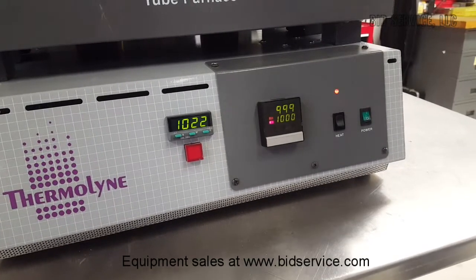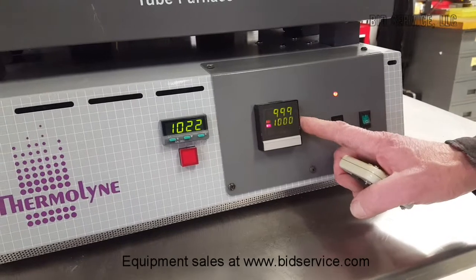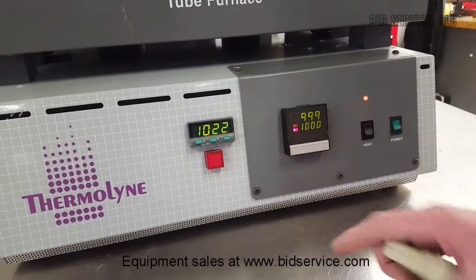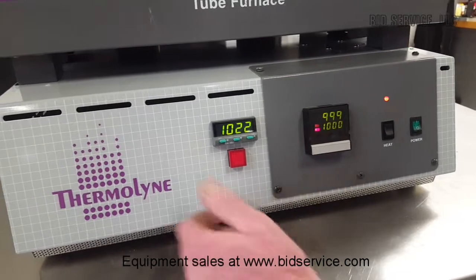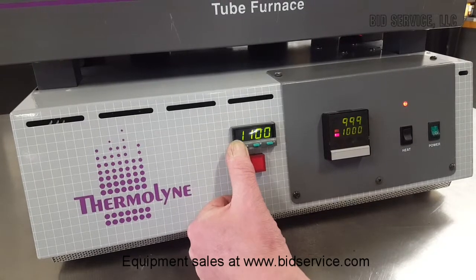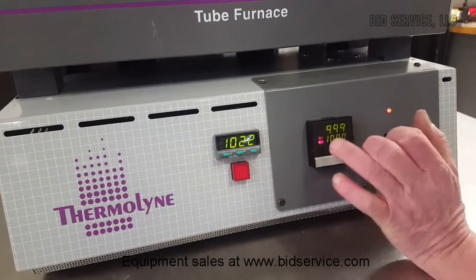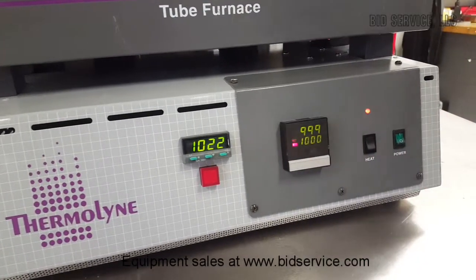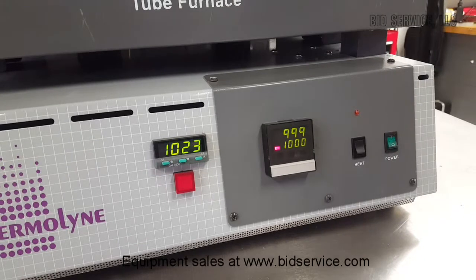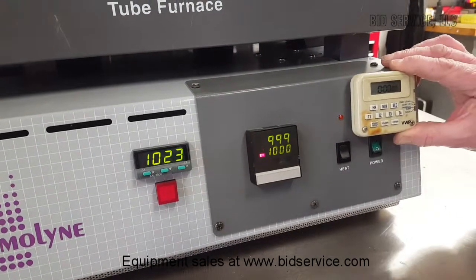We've returned and we're just about up to our set point of 1,000 degrees. The over-temp display reads a little bit higher, but it won't kick out because I've set it to 1,100 degrees. As you can see, the heat light is blinking — that indicates that it is controlling the temperature and holding it at the set point. We'll let that run for a half an hour and then come back.